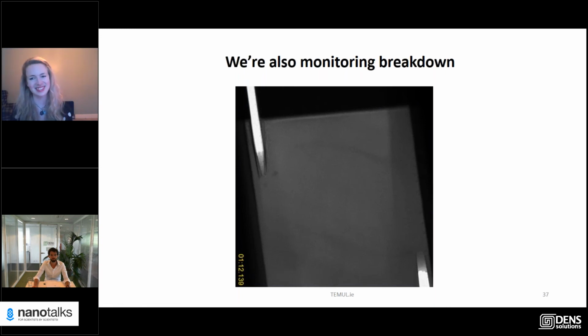Okay, great, thanks. Since you are interested in the effect of electric field, did you make the contacts between the lamella and the biasing electrodes on the chip? Yeah, that would also be a good question to go back to you about. It would be great not to have to put down those contacts. I don't know whether that's even possible.